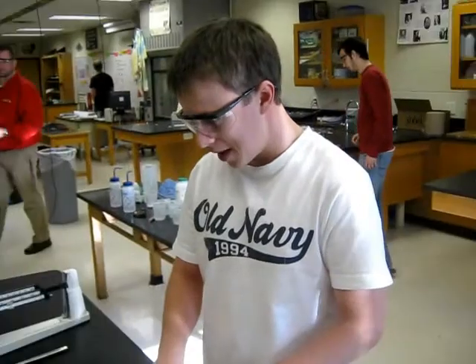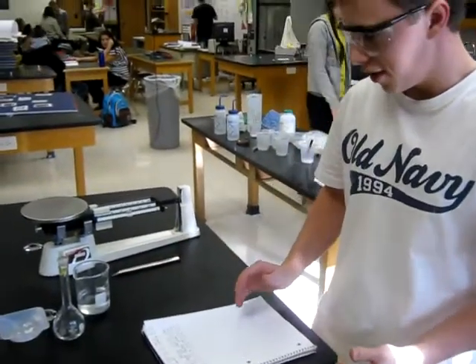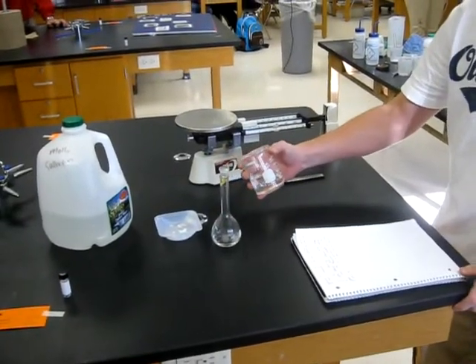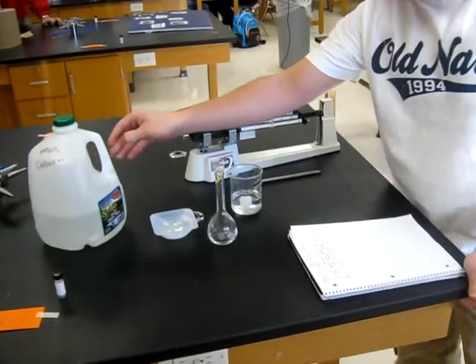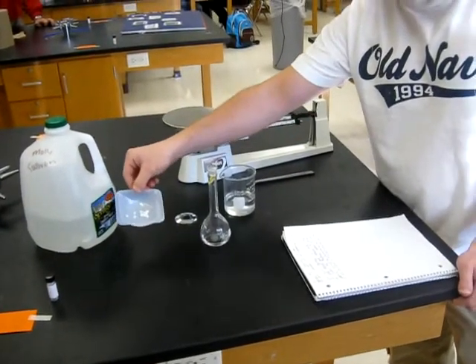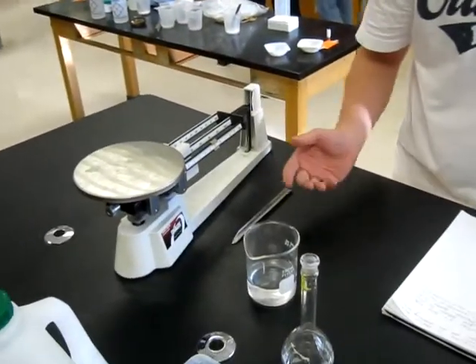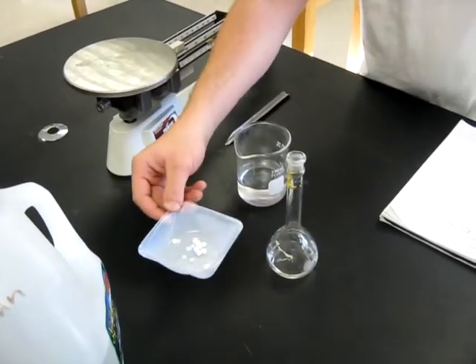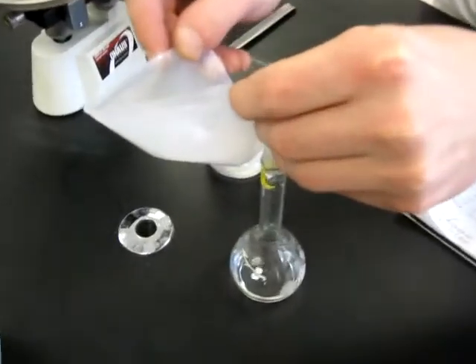So right now we're going to make our 0.5 molar solution of sodium hydroxide. What we're going to need for this is a 100 milliliter volumetric flask. We have a 250 milliliter beaker here that is filled with distilled water at the moment. Here's the distilled water. We have our sodium hydroxide pellets in there that we measured with our triple beam balance. We're going to be using 2 grams of the sodium hydroxide as we got from our equation. And I'm going to go ahead and add that into our distilled water. We need 100 milliliters of it.